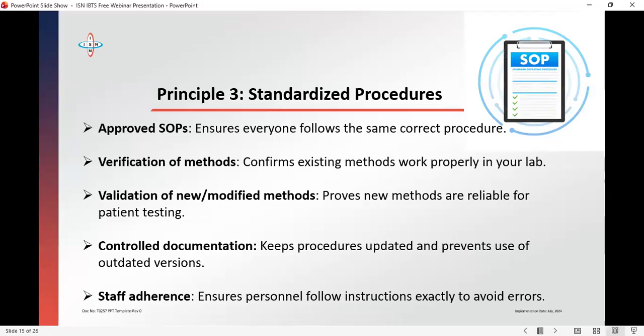If you collect an instrument and you do not verify that it is fit for use, do you do a precision testing? Do you do a correlation testing? Are your instruments on EQA to validate the consistency of it? Do you even have a protocol for validating those instruments that come to you? How do you now detect factory error? It is a requirement that you have a method to validate your lab standard operating procedures, that they are fit for use.